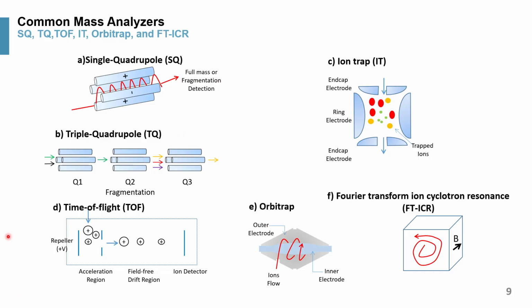In the high resolution arena, we have the time of flight, Orbitrap made by Thermo Fisher Scientific, and Fourier transform ion cyclotron resonance. This is very expensive, so this is rather uncommon.